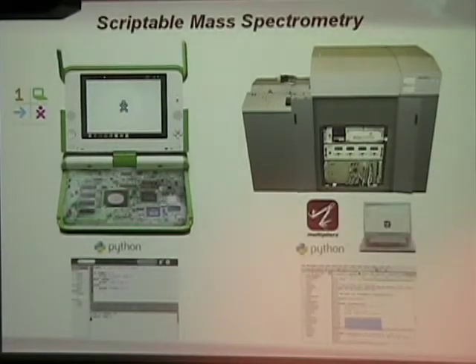Right now, we're doing it for the data files of the instrument. But our goal is to actually take the scripting approach all the way to the acquisition phase. And there's good reason to think that that's possible. So we want to make this stuff more accessible, more scriptable, so we can try new things. We need more sites experimenting outside of the standard operating procedures.